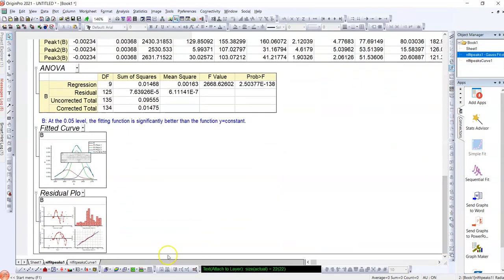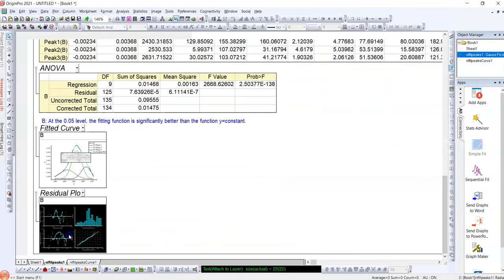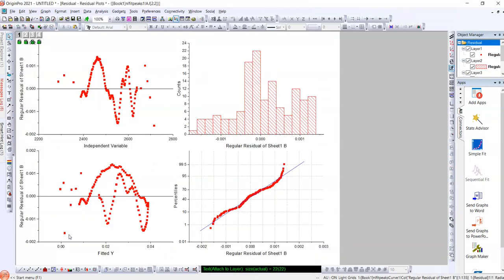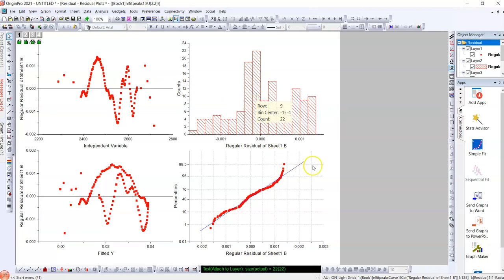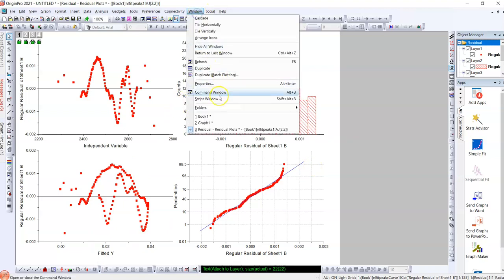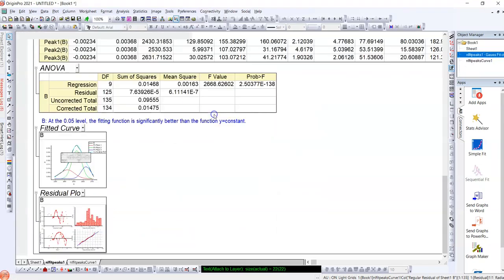This is our residual plot as I already told earlier. This is the residual plot. This goes around zero axis, shows the goodness of fitting. And this is the column plot of the residual. Residual actually gives us the idea about the goodness of fitting, nothing else.